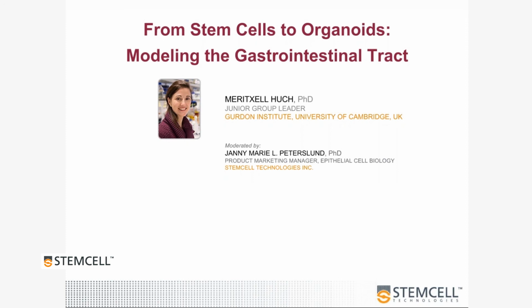Regarding the cryopreservation, which is the easy one, yes, the answer is yes. For all of the cultures, we've managed to freeze and thaw them afterwards, with complete preservation of the characteristics, in the sense of self-renewing and also differentiation capacity.